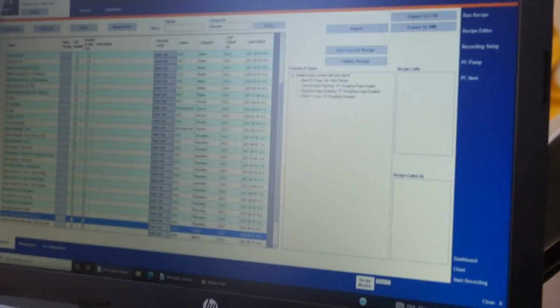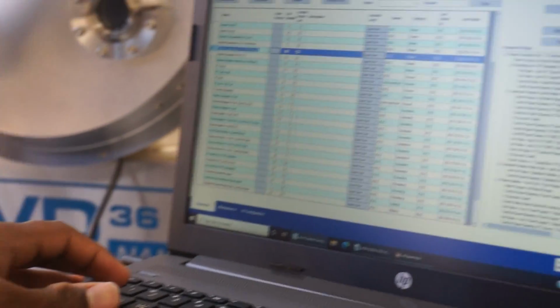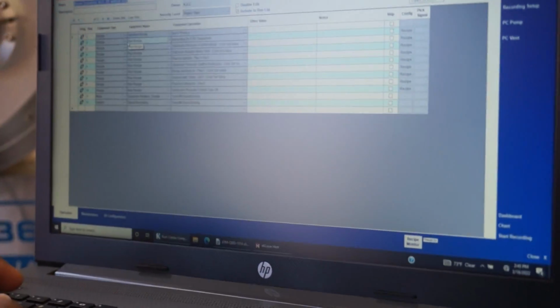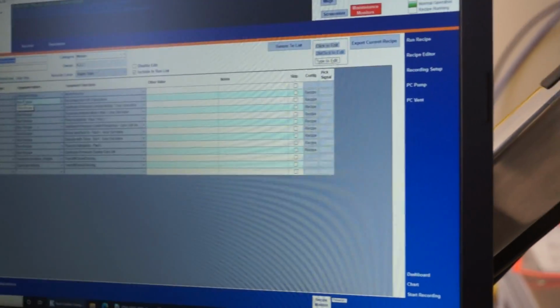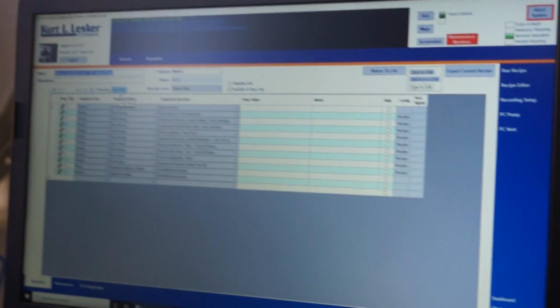Okay. So, if you click on the master recipes, the one without heat is probably the simplest. Just click on view recipe. Look over to the right. Oh, got you. So this is it. These are all the steps, and it's going to execute each step. It's going to go down to the next line. And if I want to make a copy, I simply click copy step.